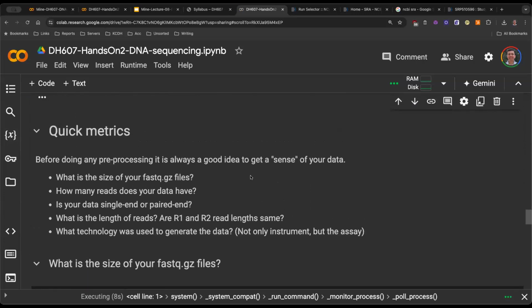Anytime you look at data, before you start to process anything, you should always visually check what you're looking at. Try to be a bit more cynical here. I've seen people who work in machine learning take one data set and try to apply all possible algorithms to it without actually looking at what the data is really telling you.